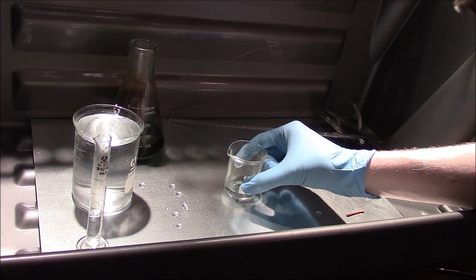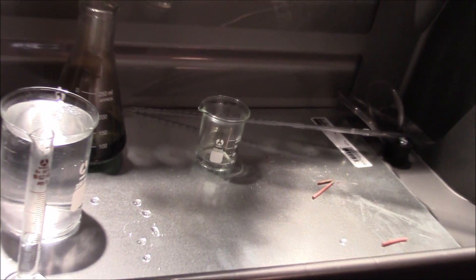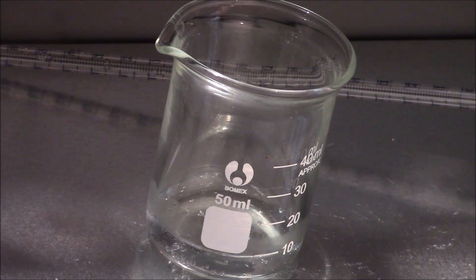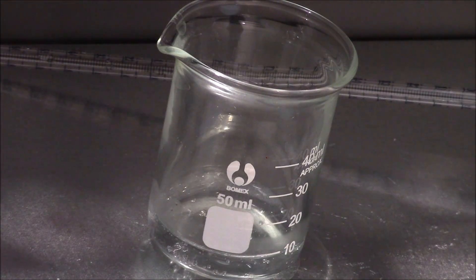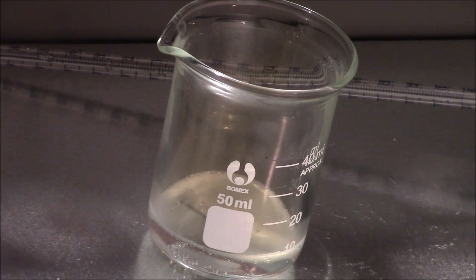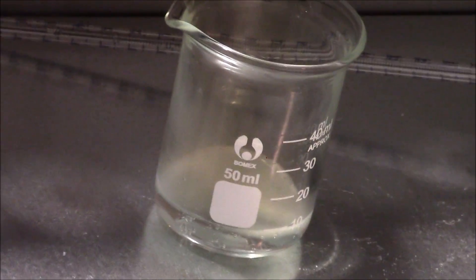We're going to move outside for this test. Here's our little sample piece of copper — we're going to drop it in — and there you go, see it fizzing. Because nitric acid is the only acid that can dissolve copper, the fact that it's fizzing when we drop the copper in confirms that we have successfully produced nitric acid.